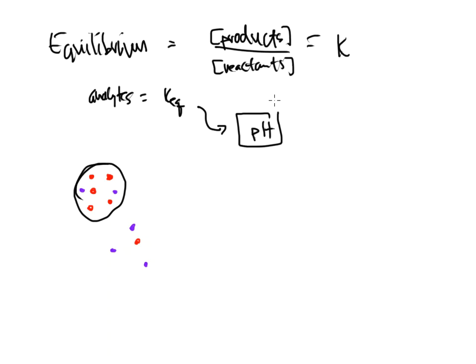pH is going to be a determining factor on how things will hang out on the surface of that stationary phase. So keep in mind, if your in-laws came around and they wanted to stay for a long period of time, you need to switch up their equilibrium. You need to switch up how inviting your home is going to be. If you can change up the pH and make your house disgusting and filthy and roach infested, then your in-laws probably are not going to stay that long. So they're going to come, they're going to visit, but poof, they're out the door.